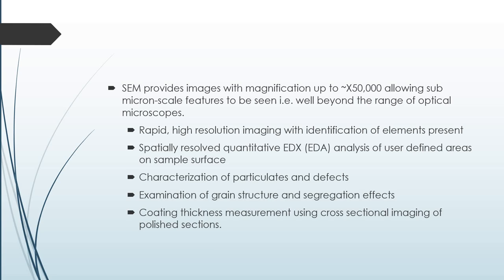Next is spatially resolved quantitative EDX analysis of user-defined areas on the sample surface. Characterization of particulates and defects. Next is examination of grain structure and segregation effects. And coating thickness measurement using cross-sectional imaging of polished sections.